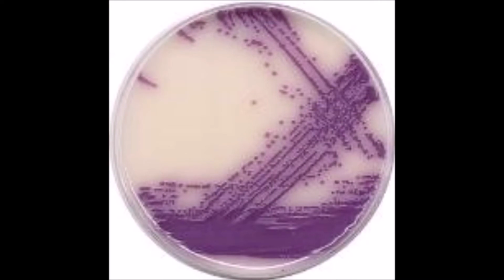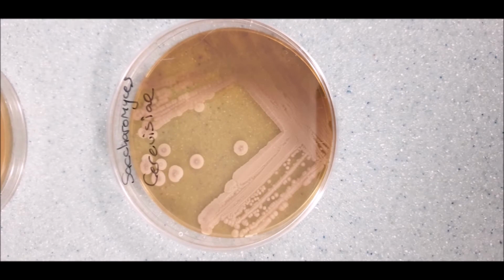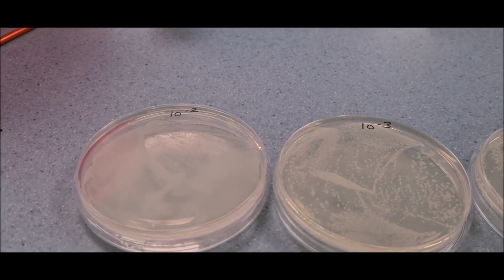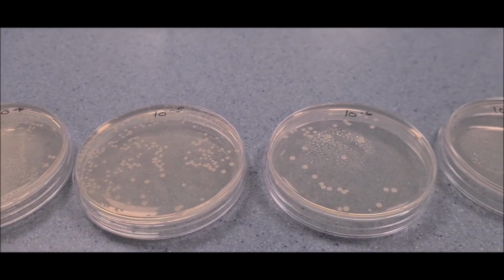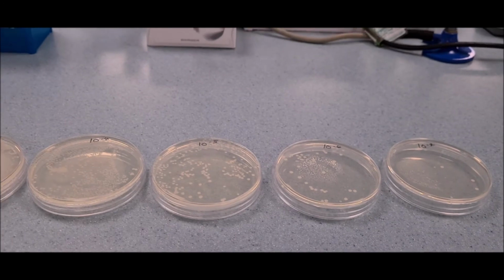Various confirmatory tests can be carried out on isolated colonies from the various selective and differential media, to confirm the identity of the organisms. Refer to the practical handbook for examples of such confirmatory tests. The next step is to select appropriate dilution levels, with colonies between 30 to 300, and count the colonies using a colony counter. Refer to the interactive video session on aseptic techniques.